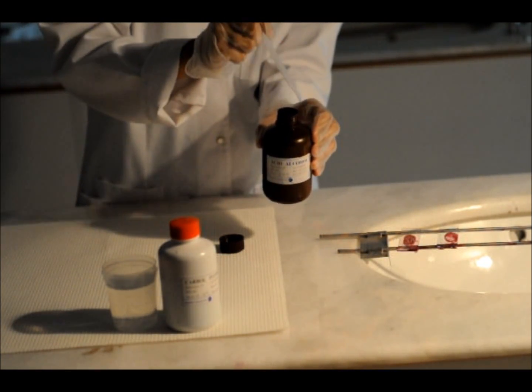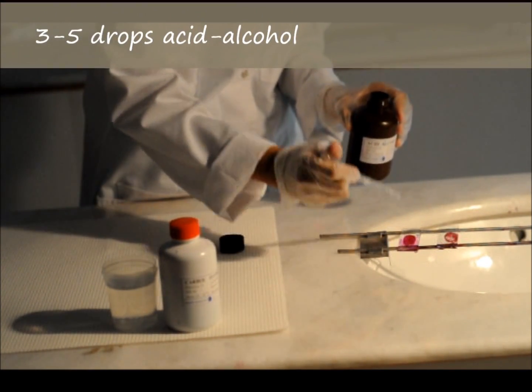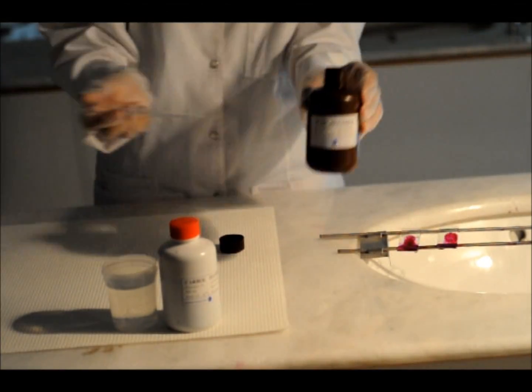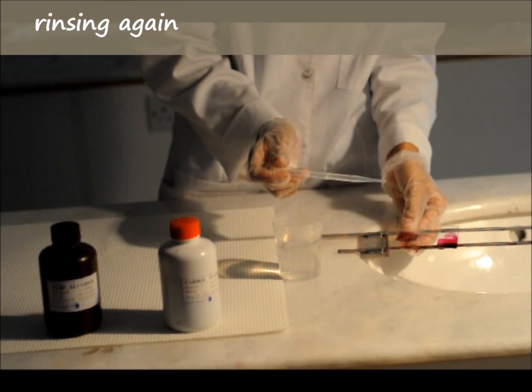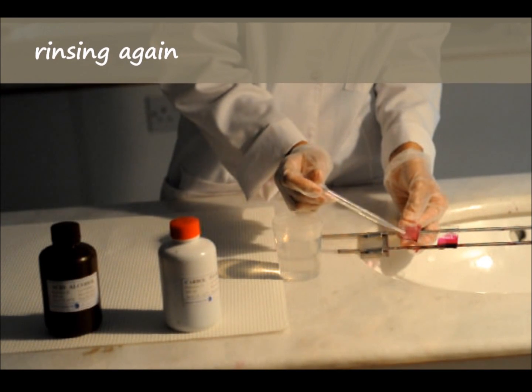Then place an acid-alcohol solution to remove the stain. Acid-fast structures will resist the acid-alcohol stain action. Rinse in tap water again.